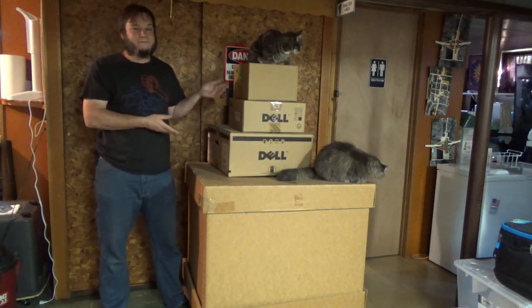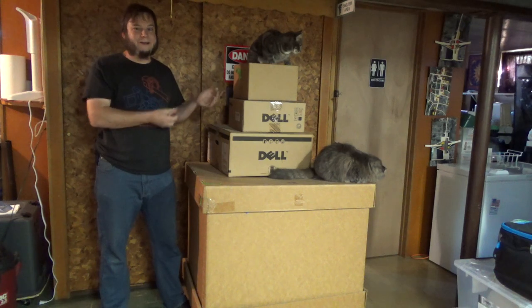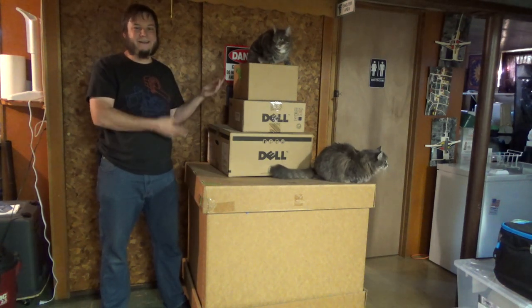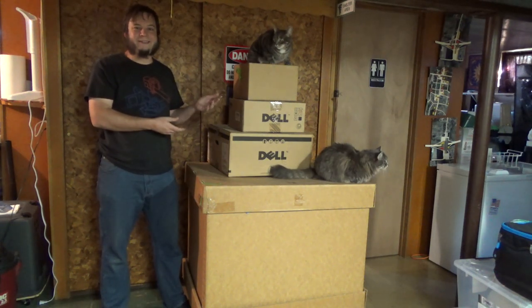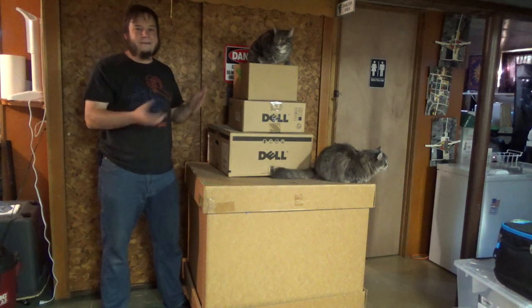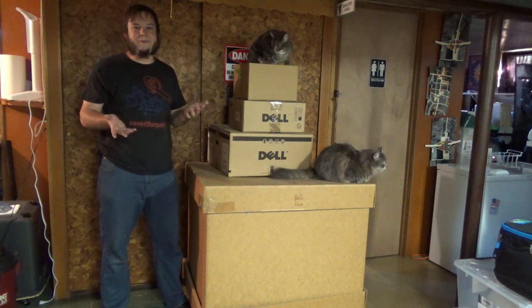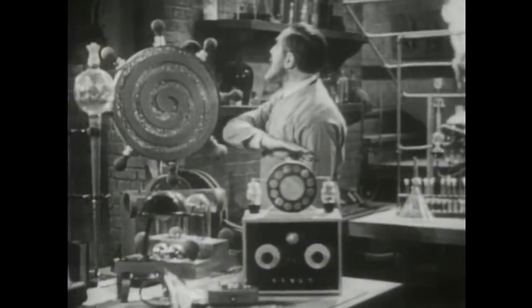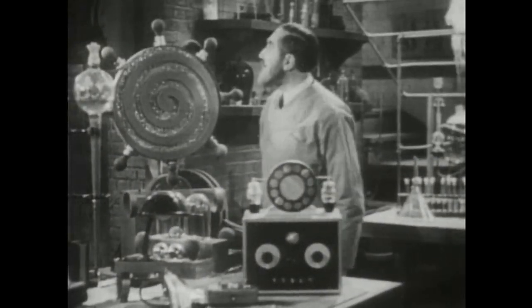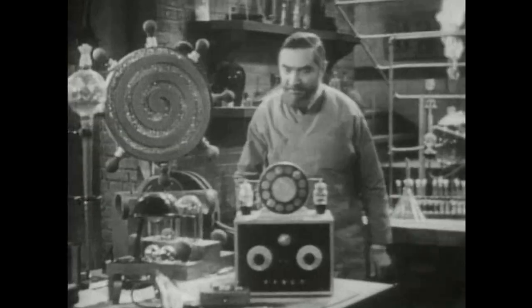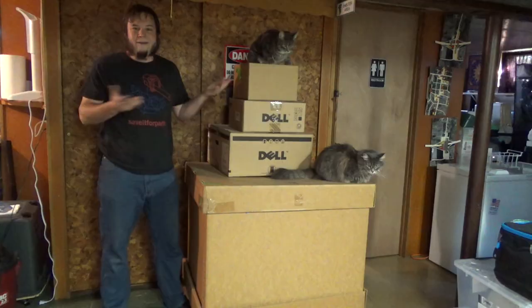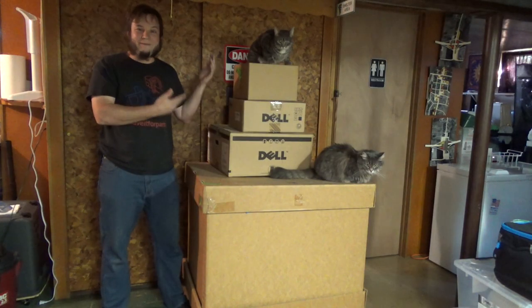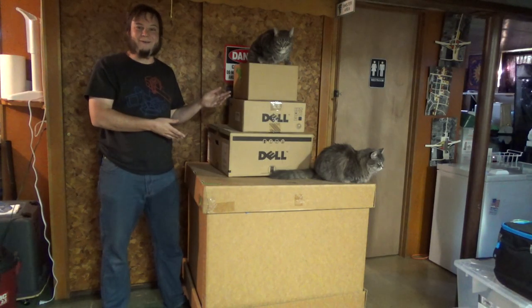Now, I don't know how it works, I don't know if it does work, I don't know if I'll be able to tell anything about my own ancestry or create some mutant monsters in the basement. Fools! Fools! Let them search! Or even get the thing to turn on, but it's still kinda cool.